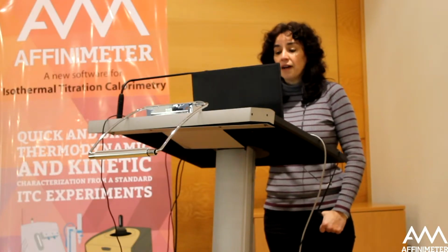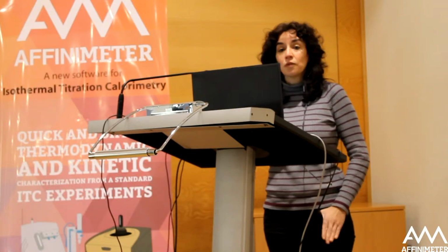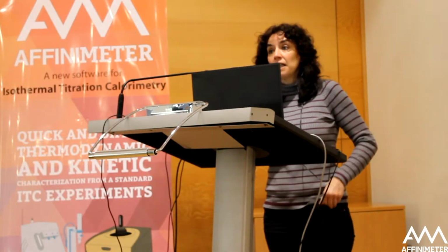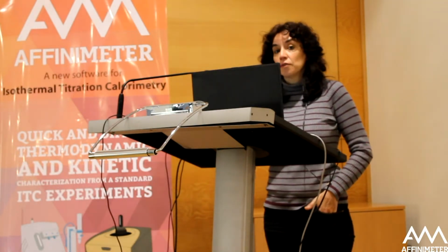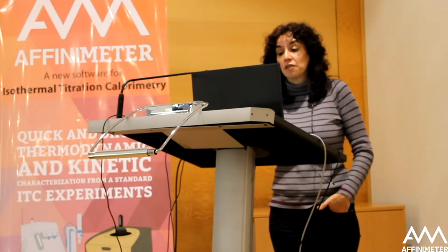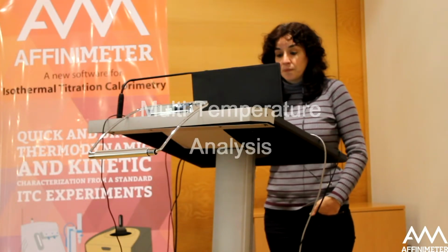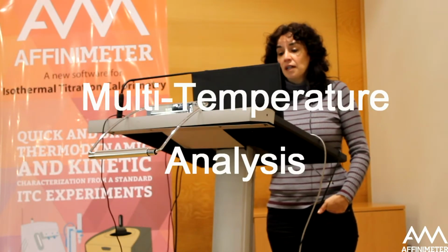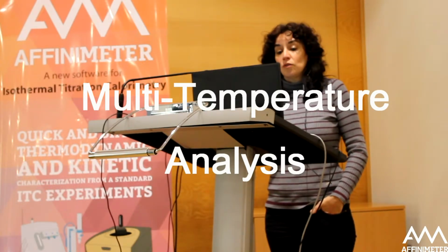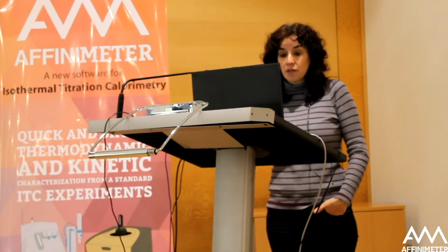So now the files I have uploaded in this tutorial of KinITC correspond to the same interaction performed at different temperatures. And in many cases, this is going to be very useful to obtain additional information of the interaction. So many researchers are interested in performing experiments at different temperatures, and we have some analytical tools to analyze these experiments at different temperatures.